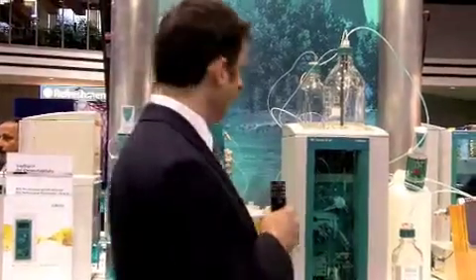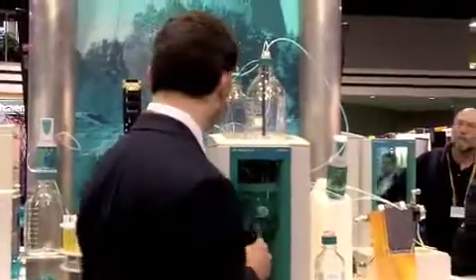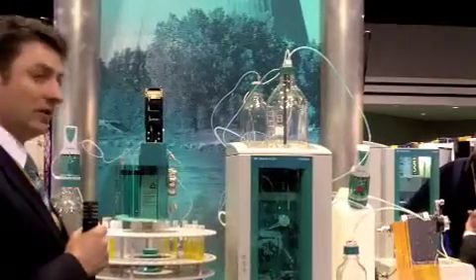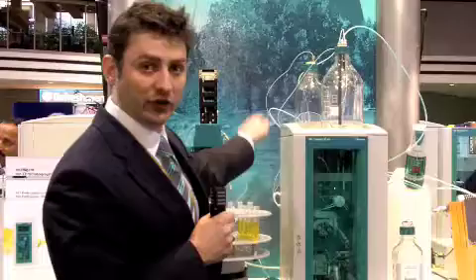So this is the first system from Metrom that includes eluent generation, inline standard calibration, automatic intelligent dilution, and ultra-filtration of the sample.